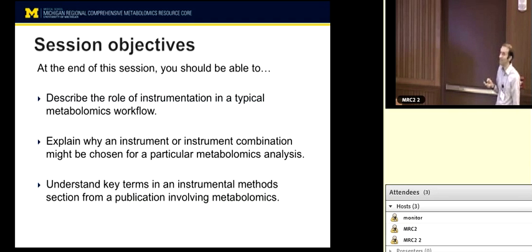It's quantitative, very easily quantitative. It stays calibrated. Its response day one is very similar to its response 3 months or a year from now, as long as your instrument is properly maintained, without excessive effort. Mass spec we do good with quantitation as well, but there's a lot more work that has to go into it. Reproducible, provides structural information. As I said, NMR is routinely used for understanding the structure of a molecule. It requires relatively minimal sample preparation. Sometimes it's good enough to just dilute and load your sample into the instrument, or load it in as is, or do some limited protein precipitation, etc.